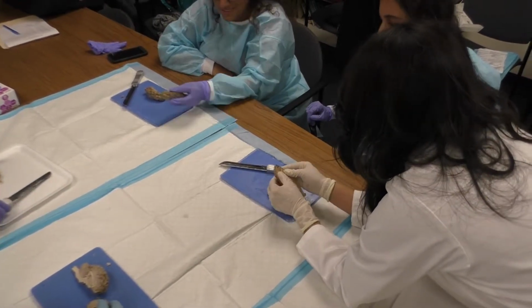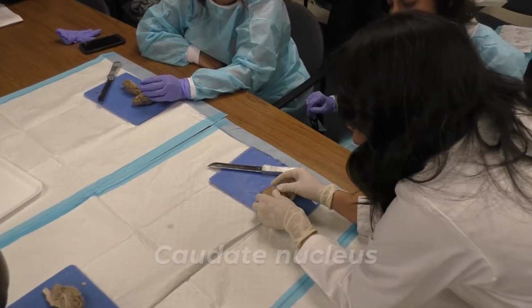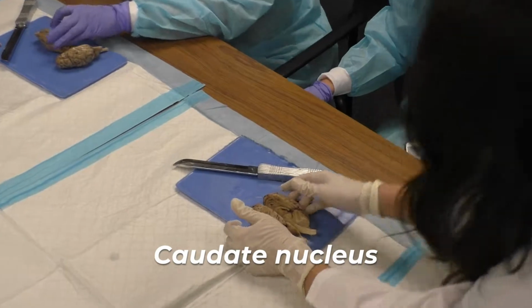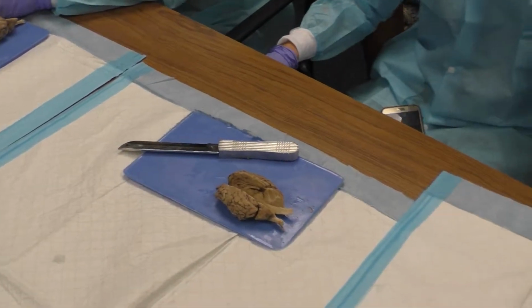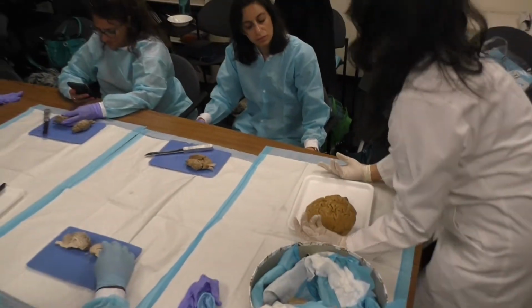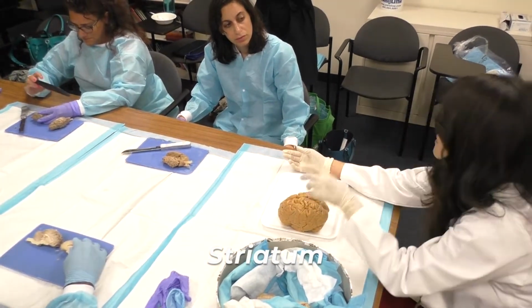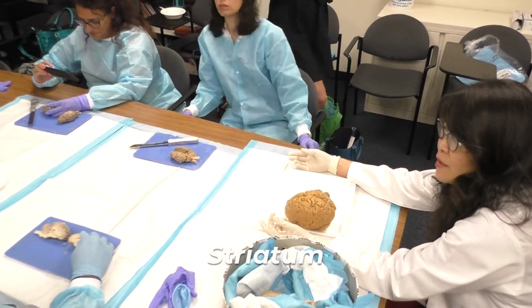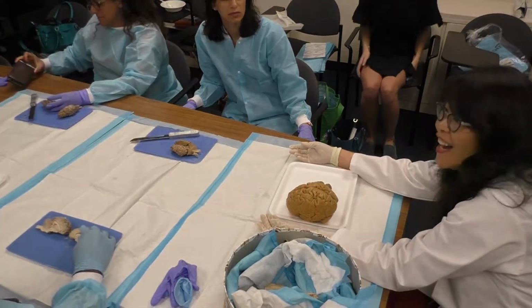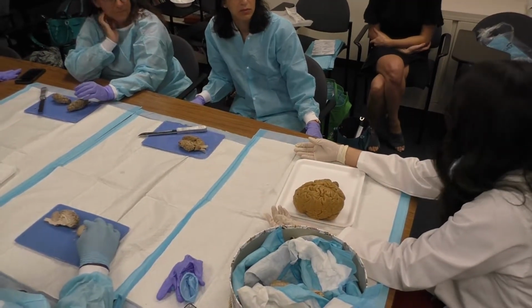Yes. So that lump is called the caudate nucleus. It's part of the striatum, and the caudate nucleus is important for motor functions. Part of the striatum is damaged in Parkinson's disease. The striatum uses dopamine, and the part that's damaged is, of course, the dopamine cells that die and cause the tremor and the motor control issues that you have.